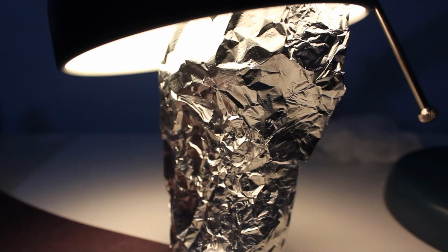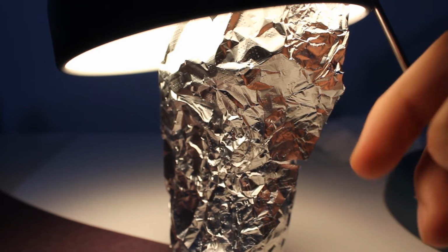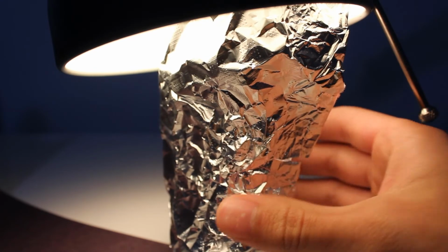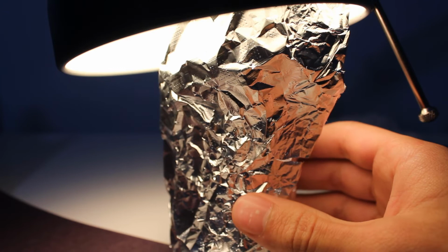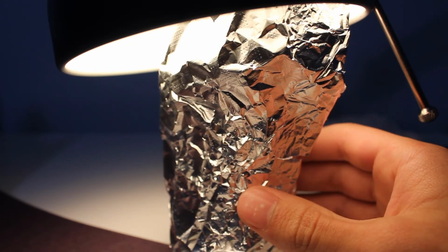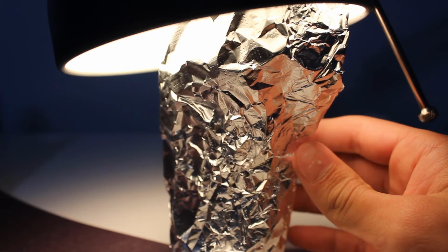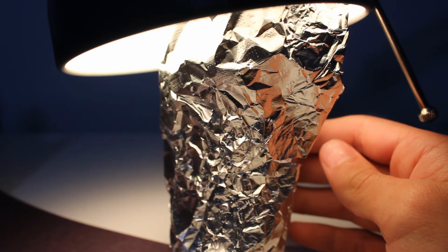So here we have it. Nice little setup. I have an incandescent bulb in here, so it's producing a lot of heat, and this aluminum foil is surrounding a glass jar with the contents that I have made, the sodium citrate inside it, and so this should drive all the moisture out of the crystals. If this works, I'll have it done pretty soon.